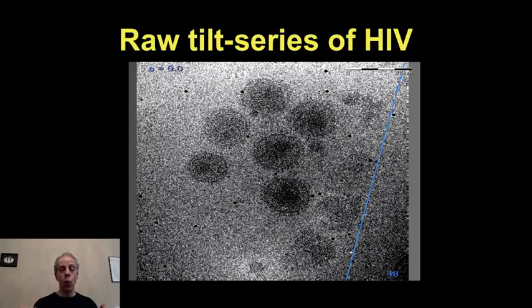This is just one of those images. Again, remember, we are interested in this kind of stuff. And actually, we are interested in these spikes. You might be able to see some of them there. But that's what we want to get, the three-dimensional shape of that. They're very, very tiny, and as we see, very, very noisy. So here's where you get the call to image processing.